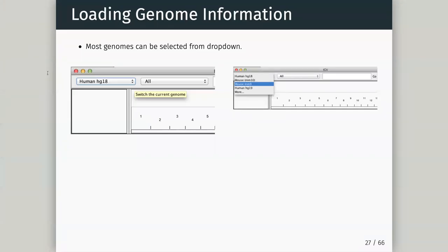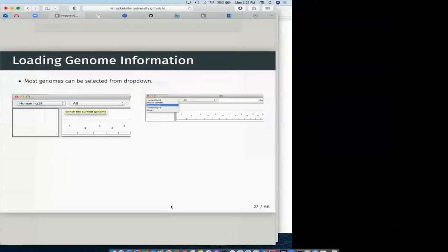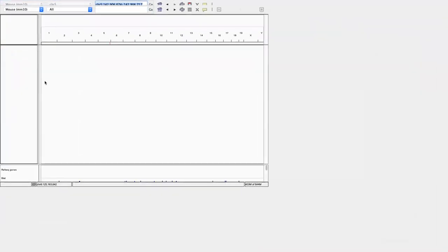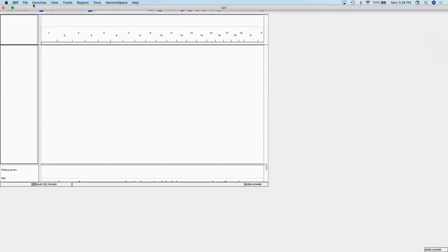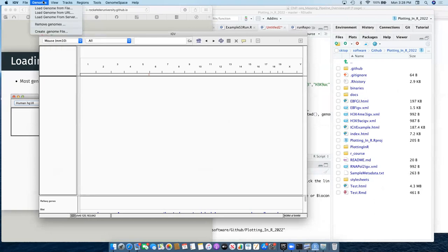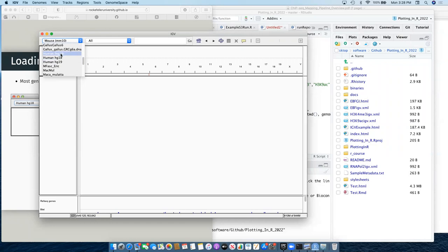Now we want to get data into IGV. The first thing we need is a reference genome selected from the dropdown. Most major genomes are available straight away - human HG38 is the latest, HG19, HG18, and mouse MM10 are there. If you want more genomes than available by default, go to the bottom of the dropdown and press 'more' to see the full list of options.